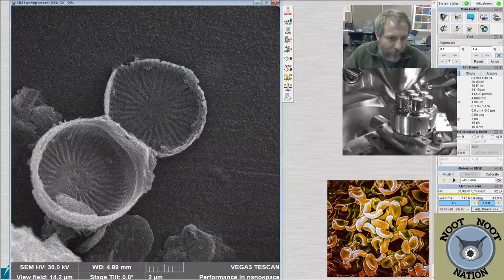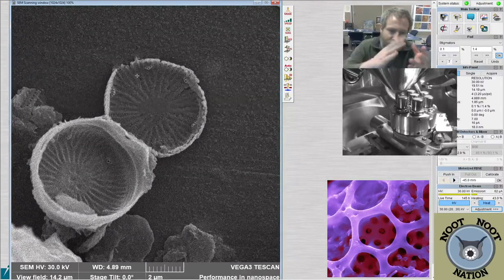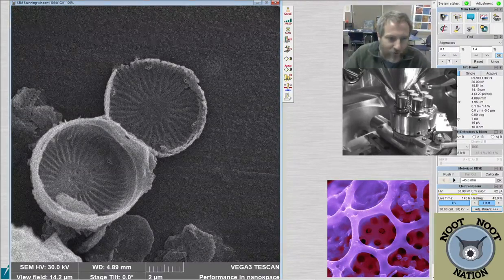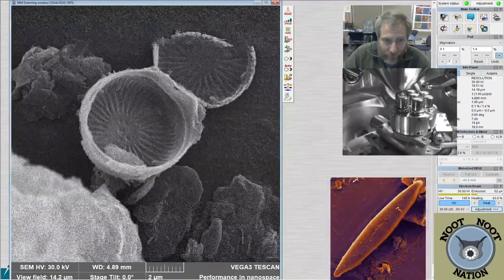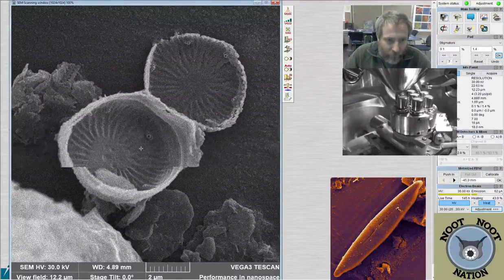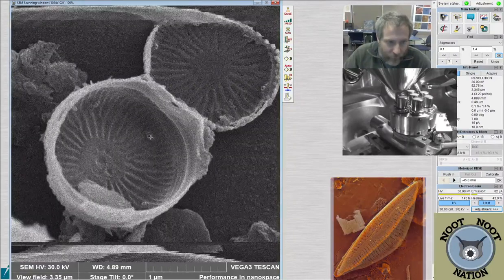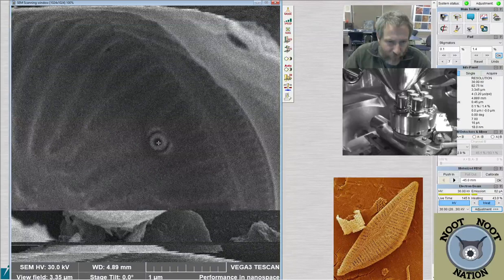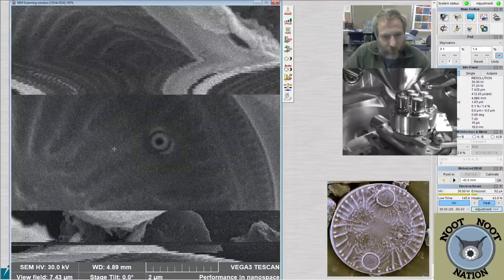This is the whole diatom. This is its inside, and that's the other valve, and it looks like it's just sort of popped open when it landed. So you can see the insides of both valves, and then they're kind of tied together by a little bit here that's linking them. This is Discostella again. I don't know exactly what species. Little Discostella are sometimes a challenge in the light microscope. I just kind of like telling one from another because the details are so tiny.